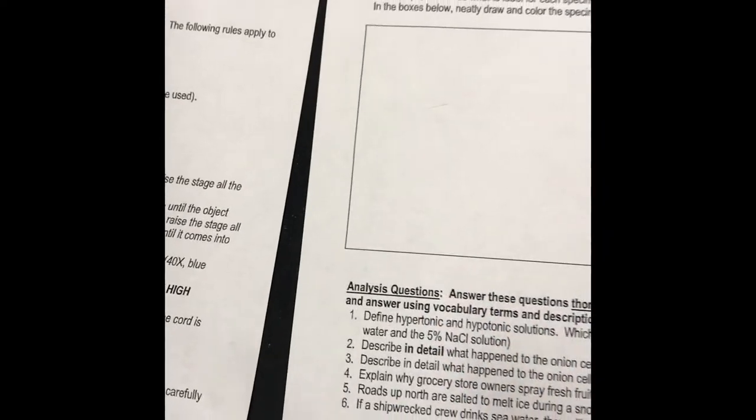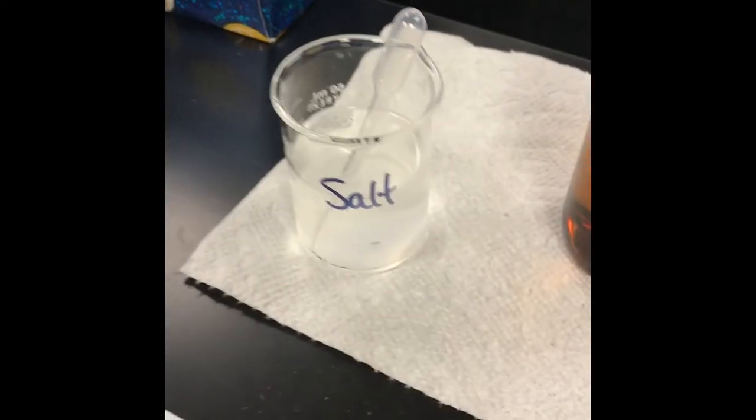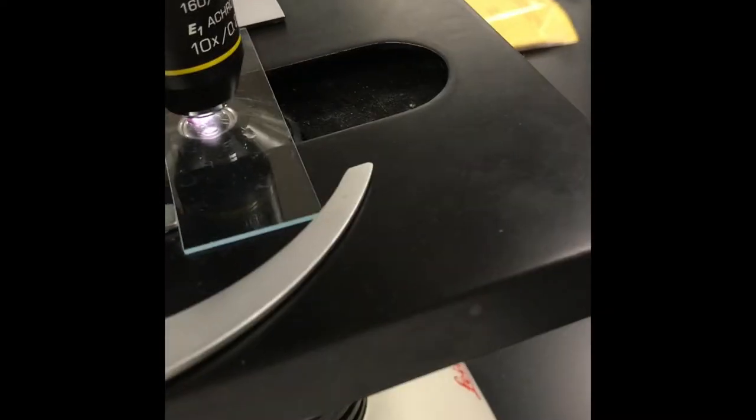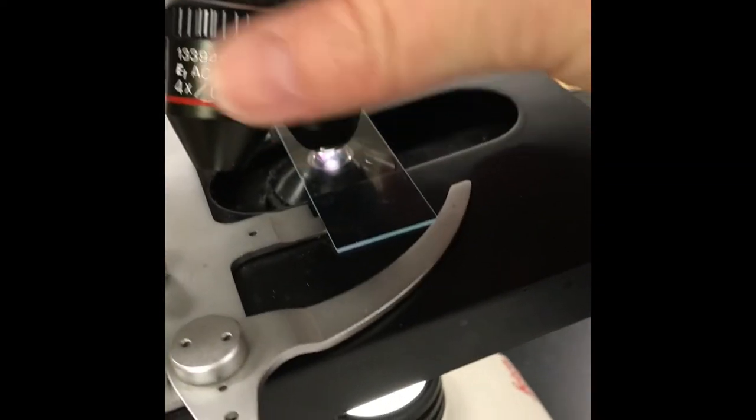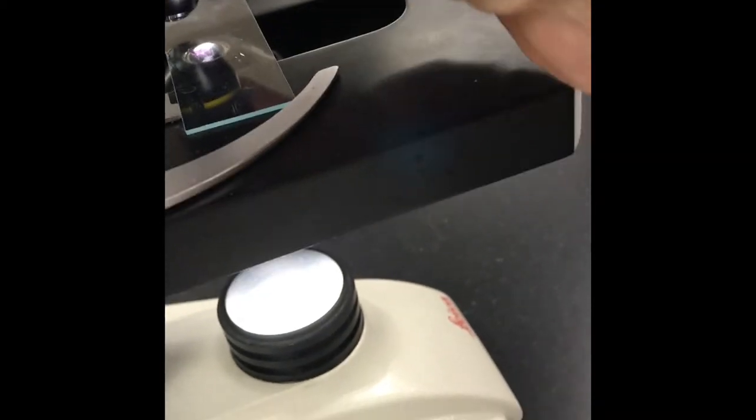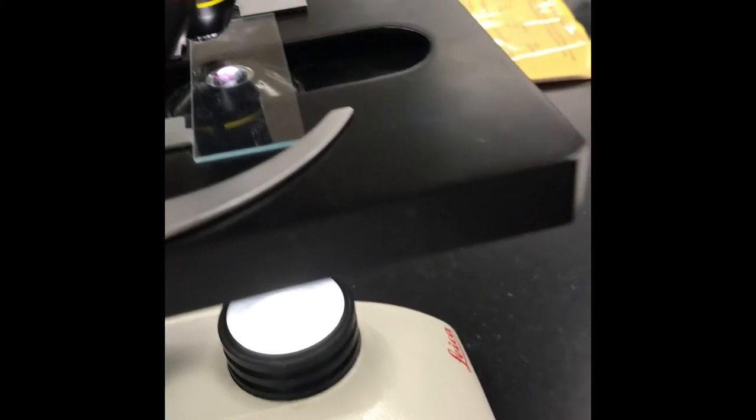Now we're ready to take some salt water and try to plasmolyze these plant cells. First, take a Kleenex and absorb some of the water from the slide to remove the distilled water. I'm going to move my objective out of the way, take a pipette with salt water, and add some salt to make them perform plasmolysis.